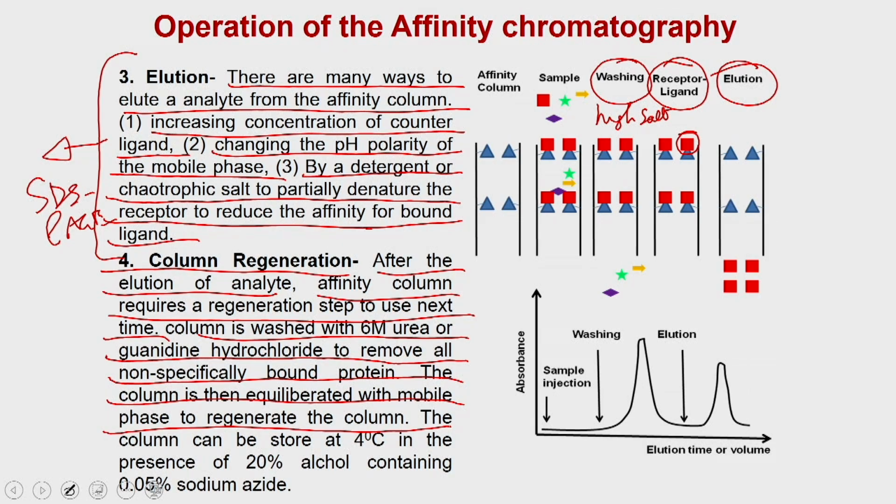In case you are not interested in using it again the next day or in the same week, you can store the column at 4 degrees in the presence of 20% alcohol containing 0.05% sodium azide.